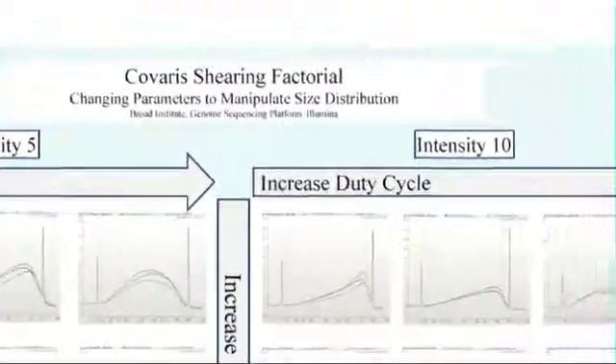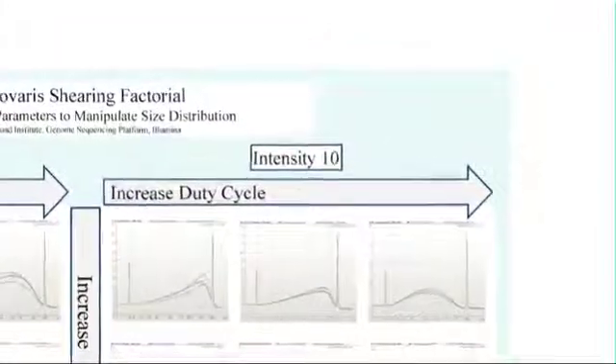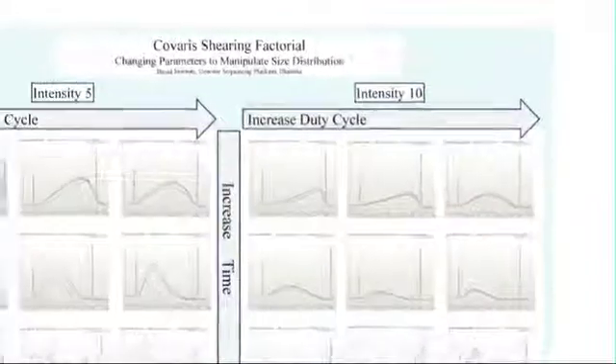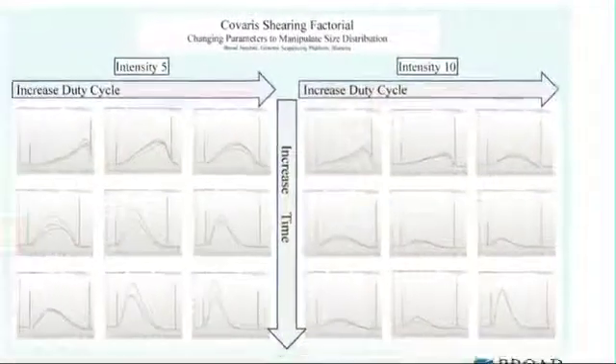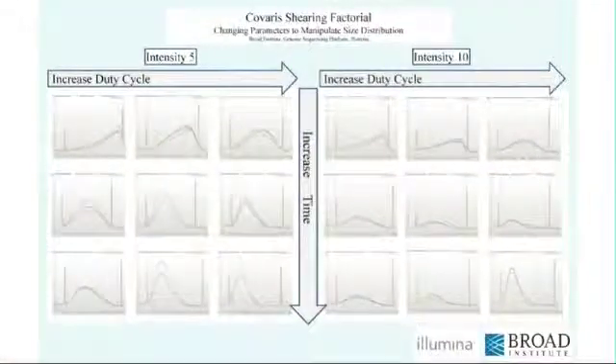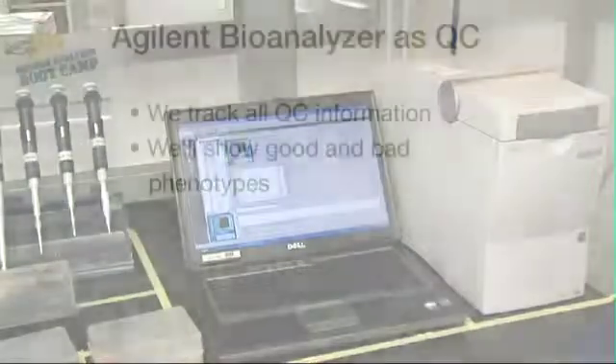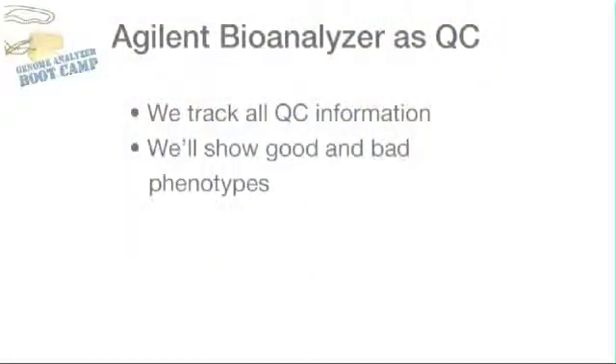It is important to control for other factors, such as bath temperature, water level, oxygen content, the tube type, and tube holder, because these variables can also affect the final shearing profile. We use the Agilent Bioanalyzer as a QC step after shearing and again after enrichment. We track all the QC information so we can troubleshoot any downstream problems. Here we'll show a combination of good phenotypes and bad phenotypes — what we'd expect from shearing and enrichment, as well as what we would not expect.